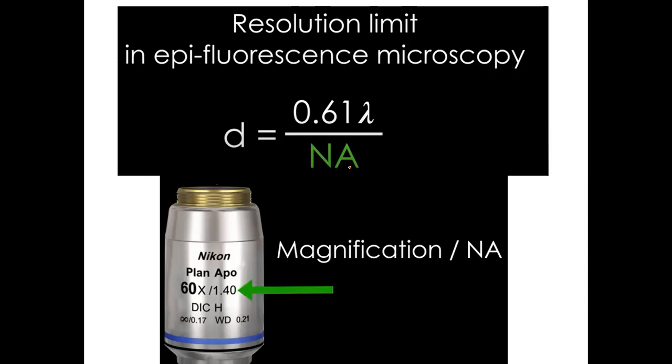So this is your definition for the resolution limit: what is the limit of your resolution for a particular object?